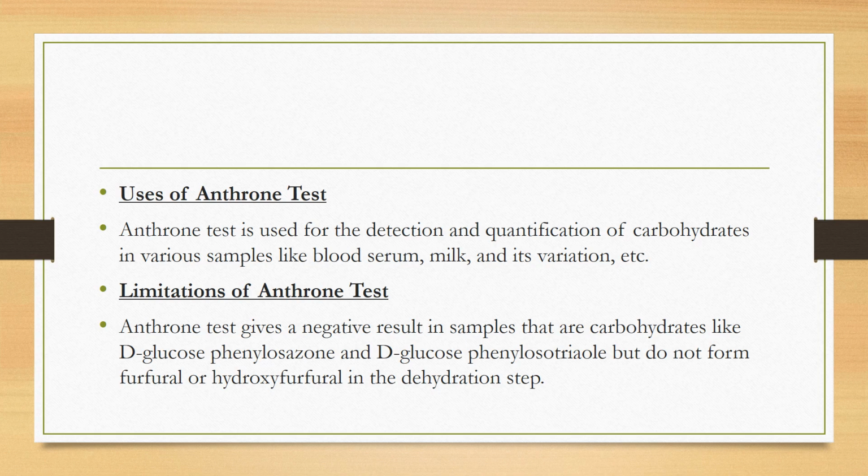These two carbohydrates give a negative result for the anthrone test because they do not form furfural or hydroxymethyl furfural in the dehydration step.